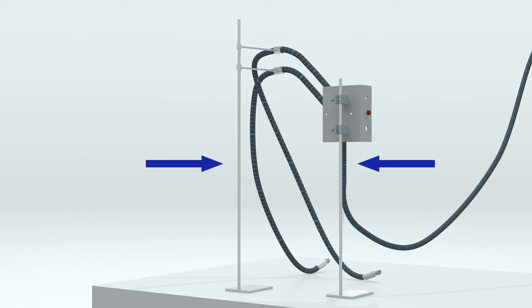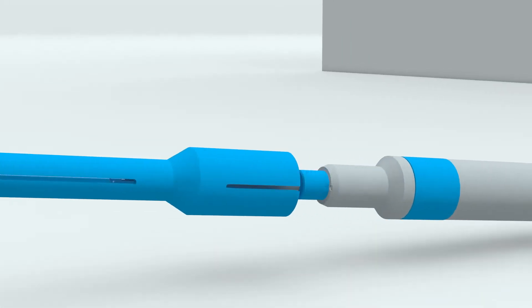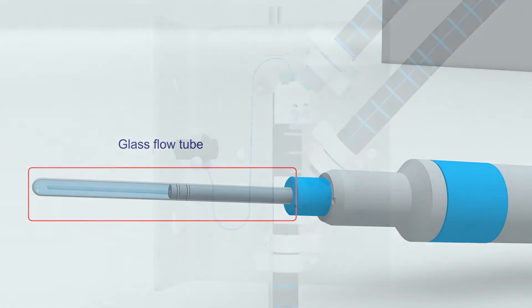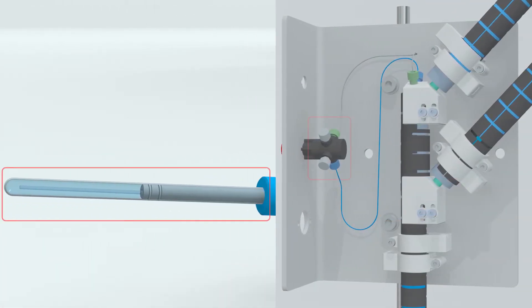Secure the Insight MR flow unit against any movement, and ideally it should be located in a fume cupboard. Remove the glass flow tube protection sleeve and inspect the flow unit for damage, contamination and leaks. Areas of particular concern are shown in red.